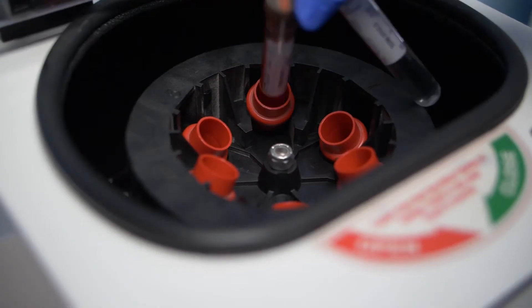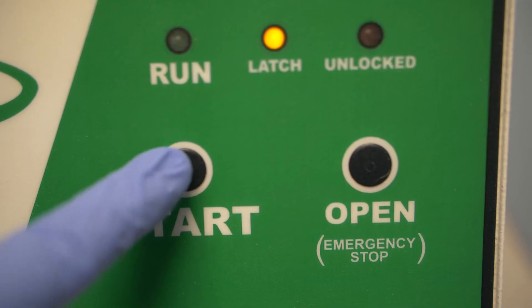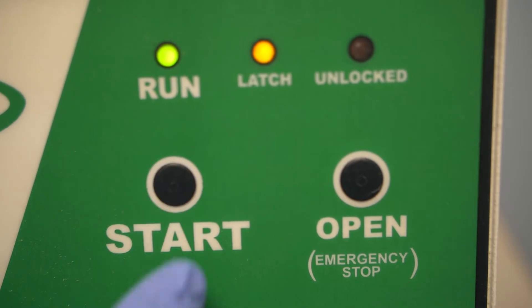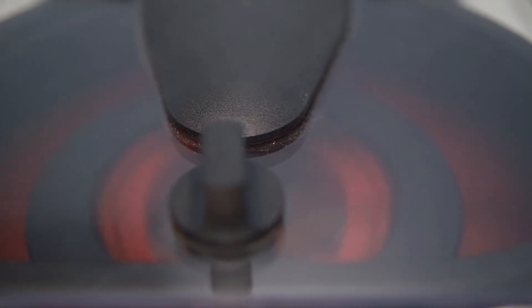Make a counterbalance for the tube you want to use. At high speeds, a centrifuge can easily become unbalanced if there aren't equal masses opposite each other in the rotor. Load the tubes opposite each other in the centrifuge, and keep a safe distance while the centrifuge is running. Bumping or moving it during use can cause an imbalance and lead to injury.